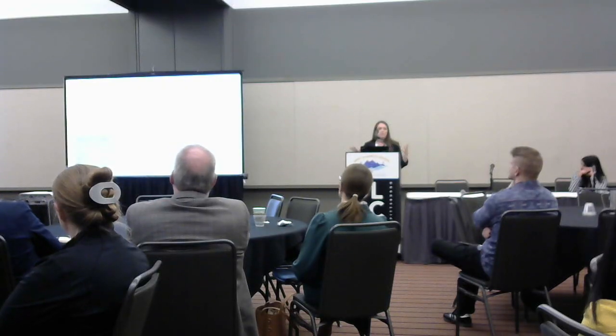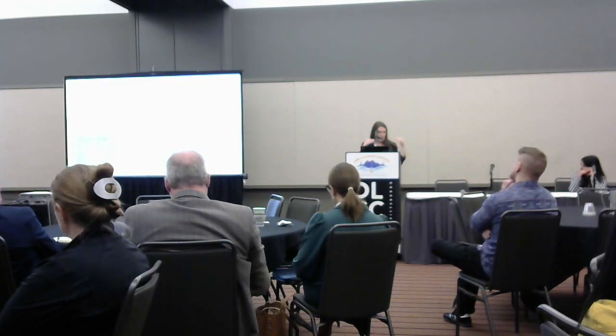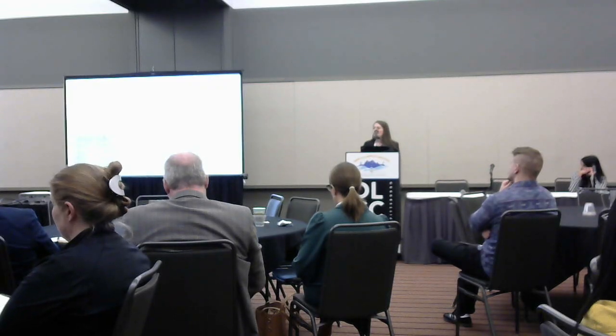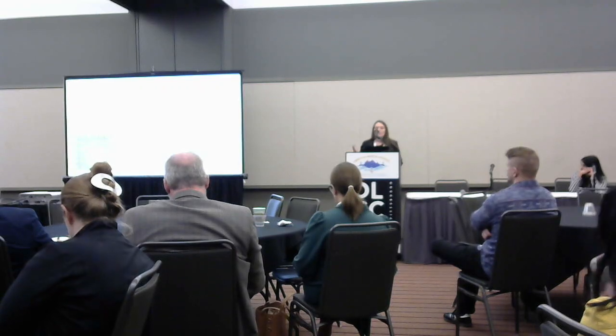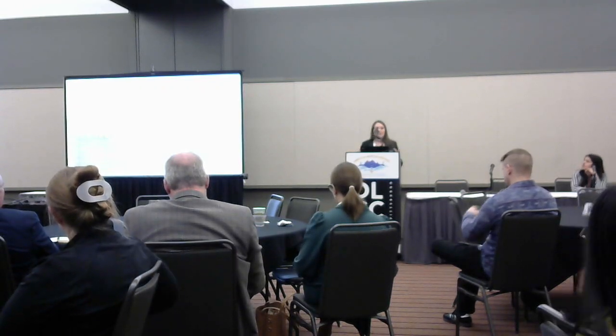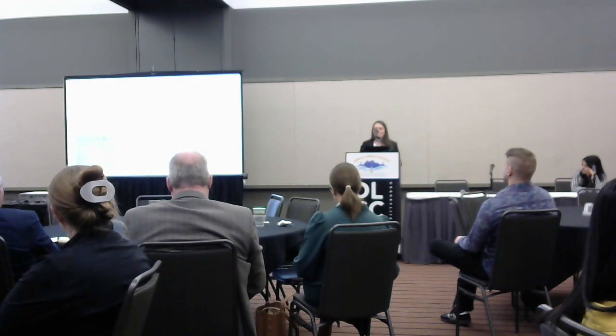So for somebody who's just beginning in image analysis, what is an image? It's an array of numbers, not just a pretty picture that I can interpret with my eyes. Secondly, mathematically, what are all the things that I'm doing to my image actually doing to my image? So if I apply a filter or a certain manipulation, how does that impact the numbers that I'm getting? Because ultimately that will impact my quantitative outcomes.